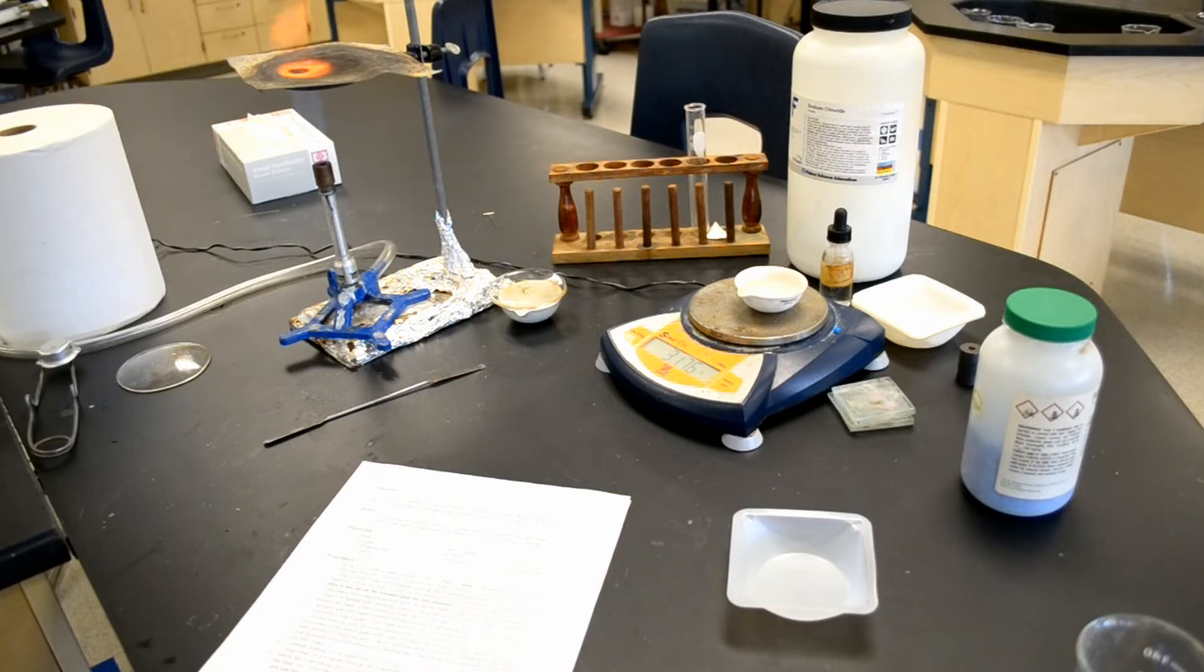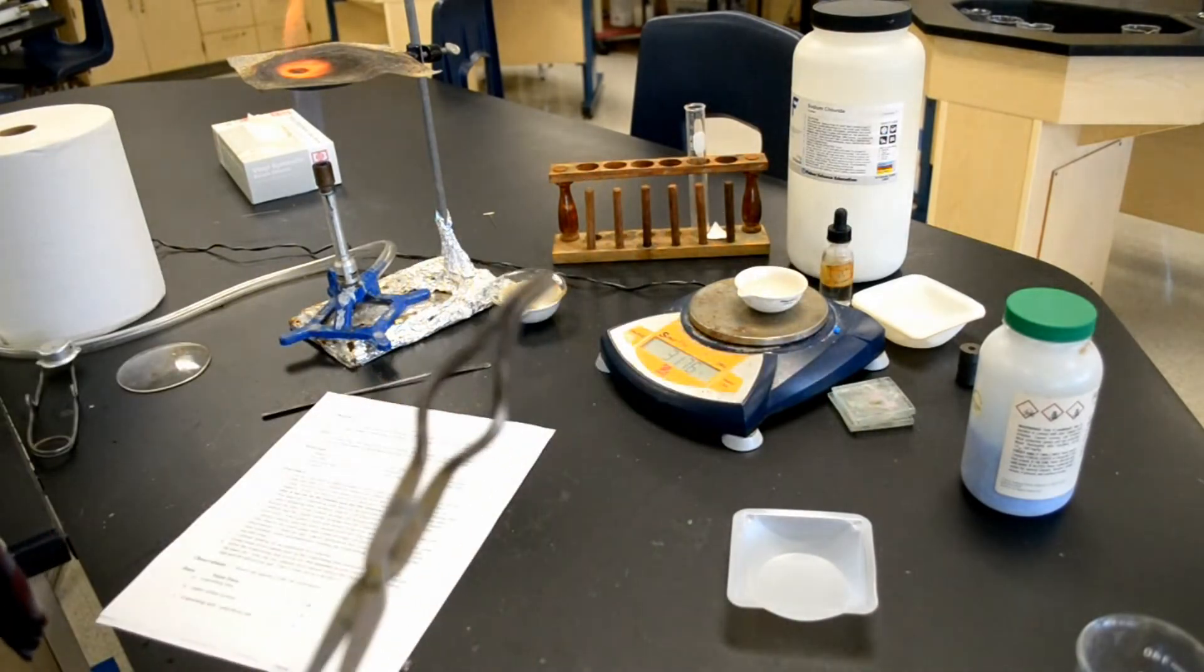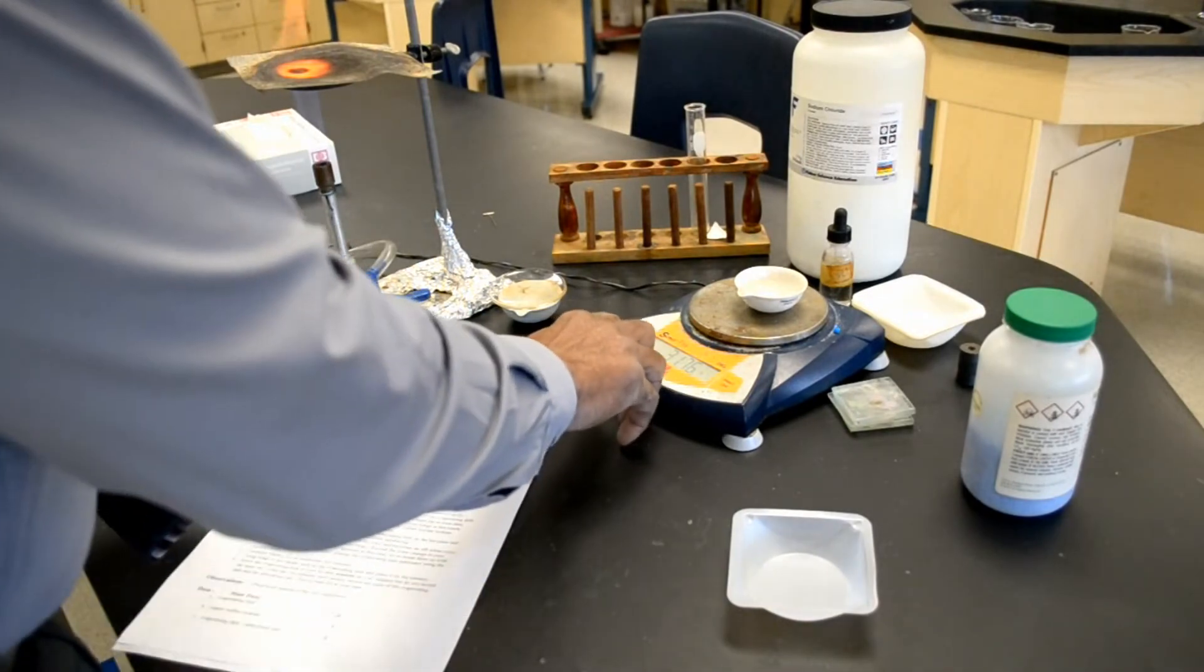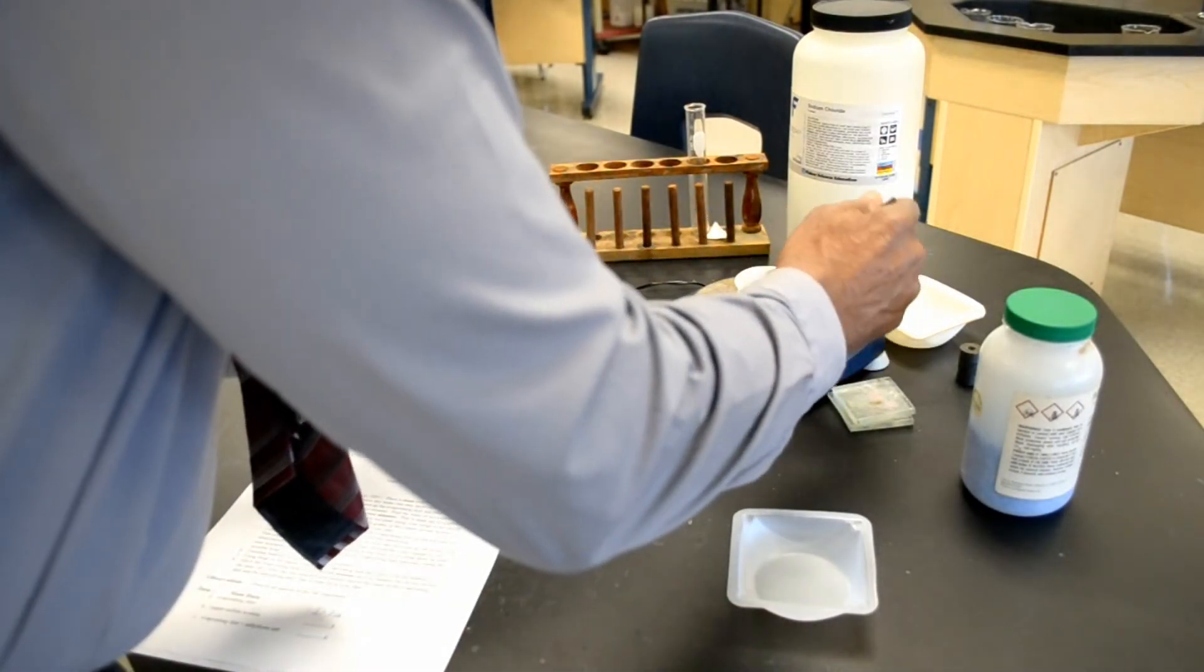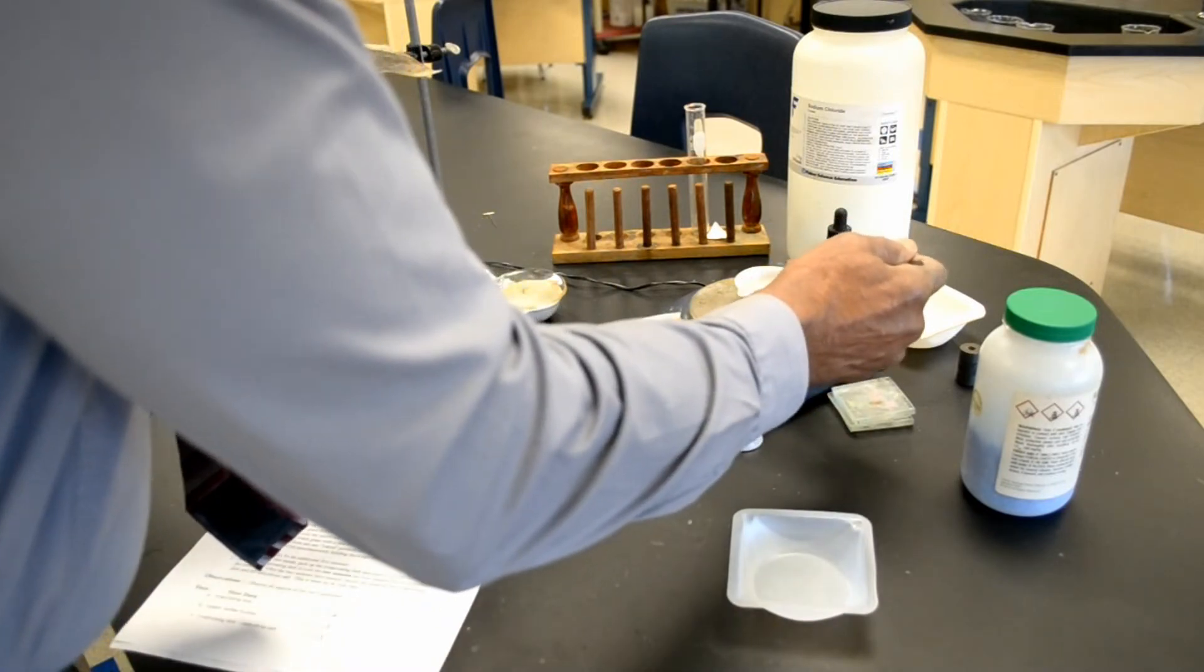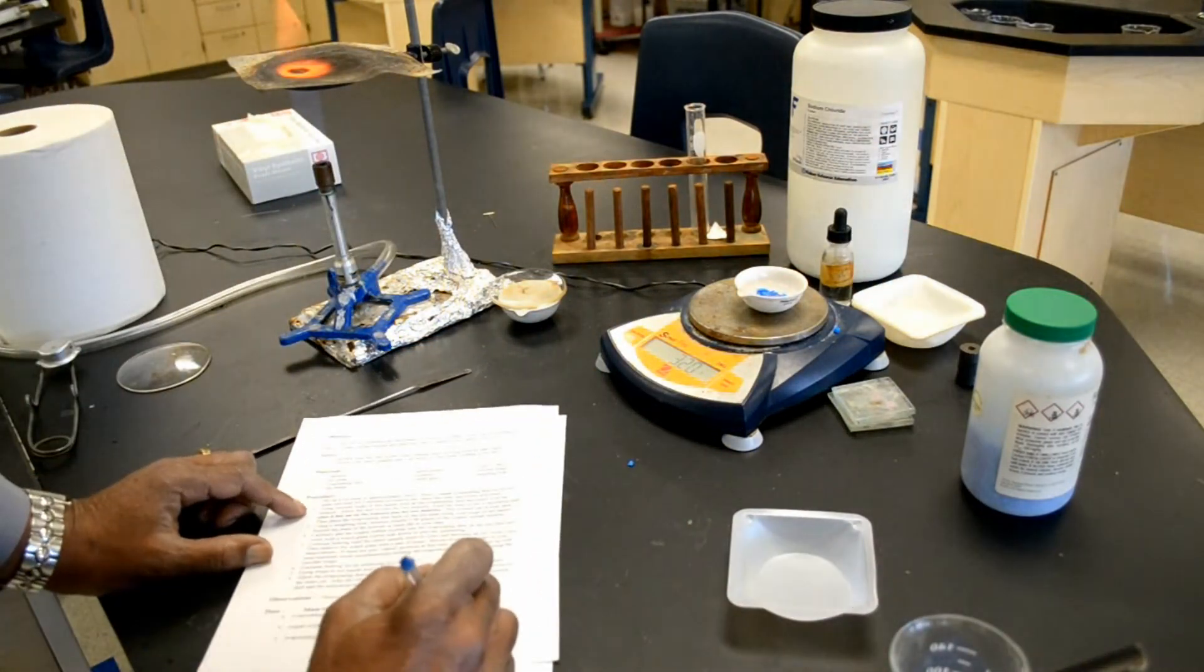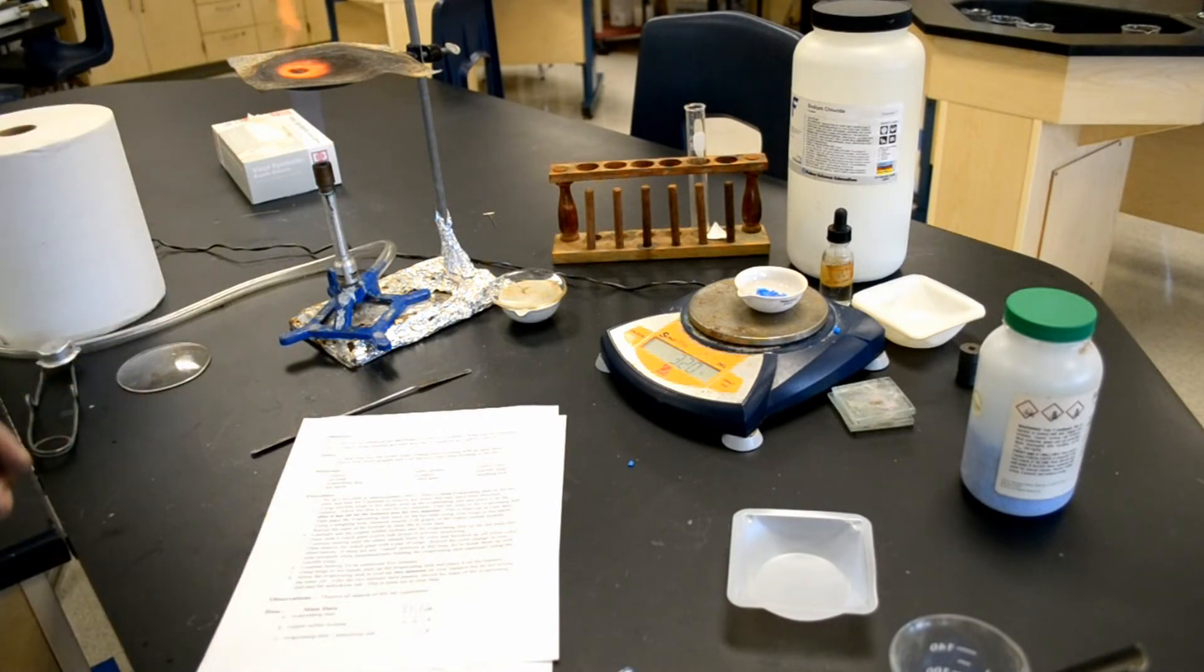Place the evaporating dish back on the hot plate using tongs or hot hands. Once again, we're not using a hot plate, so we're going to be using a Bunsen burner, but I'm actually not going to place it back on the Bunsen burner. Now, I'm actually going to weigh out 2 grams of the hydrate now. I'm actually going to weigh out 3 grams because the more mass, the more accurate the results. I actually have 3.2 grams, so 3.2 grams is the mass of the hydrated copper sulfate.